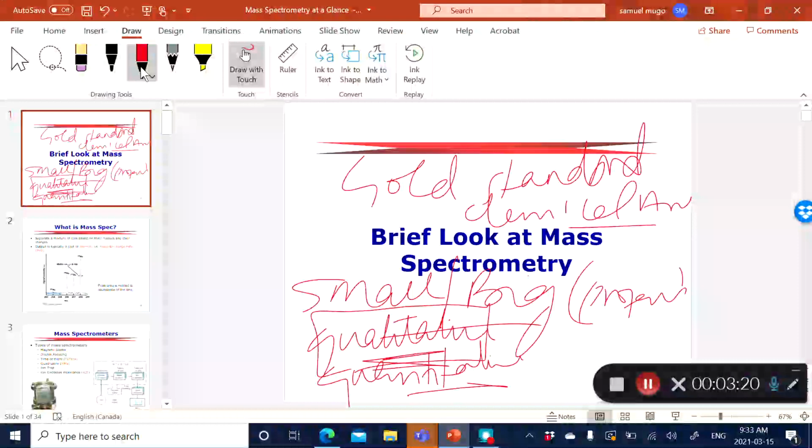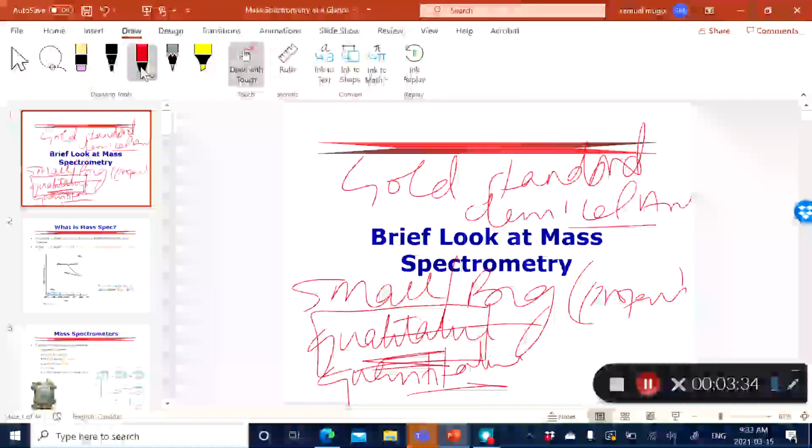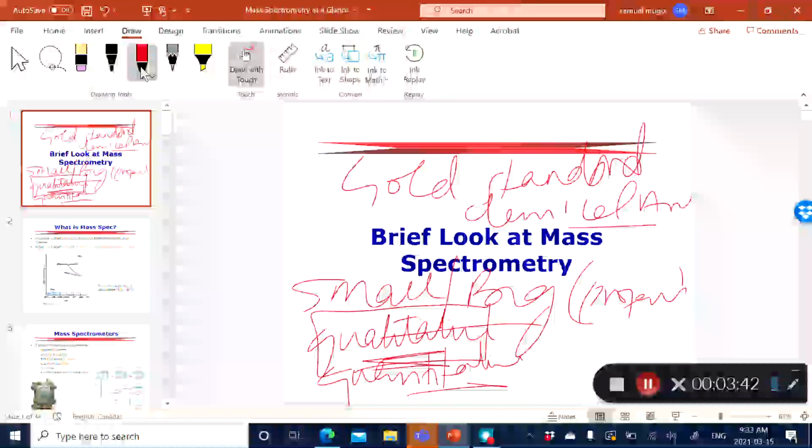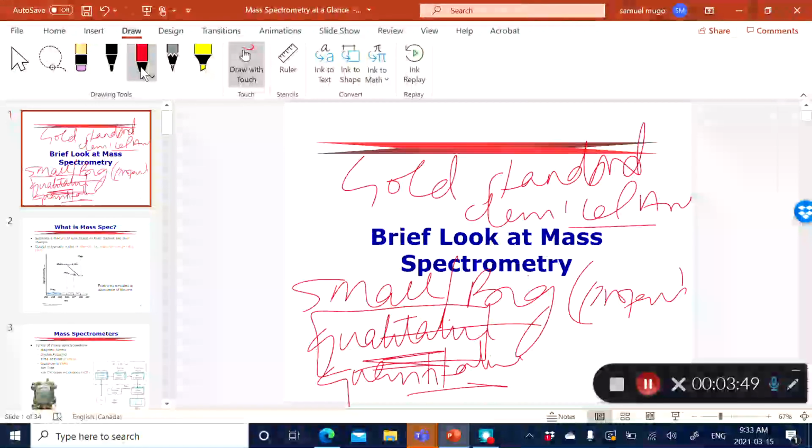And the figures of merit, remember, I'm referring to as indicators that show the performance of the instrument, things like limits of detection, sensitivities, and all that. And remember, all those things are dependent on the type of component that you use. And that is the basis of all Chem 311. We are trying to study the components so that you understand the underlying mechanism and the physical chemistry of each component and how it impacts the performance of the instrument.